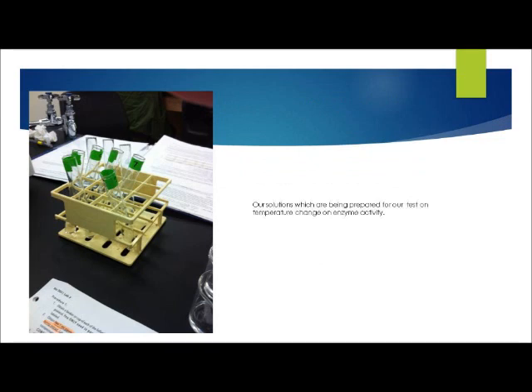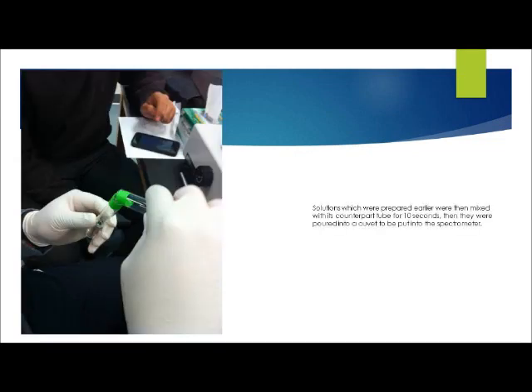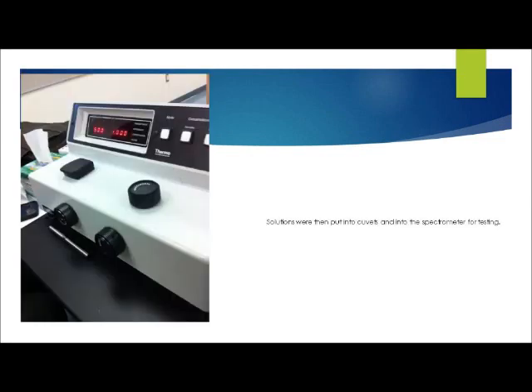This picture shows our solutions which are being prepared for our test on the temperature change of enzyme activity. Here it shows solutions which were prepared earlier were then mixed with their counterpart tubes for 10 seconds. Then they were poured into a cuvette to be put into the spectrometer for absorbance readings. Solutions were put into the cuvettes and into the spectrometer for testing, as this picture shows.